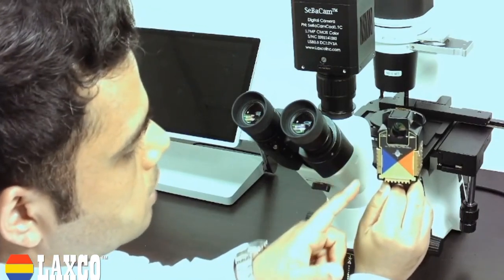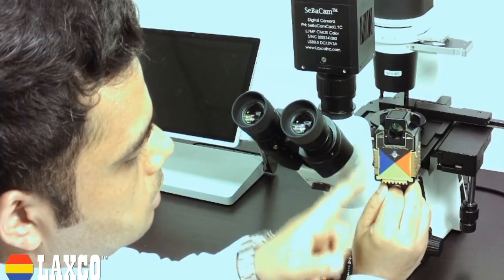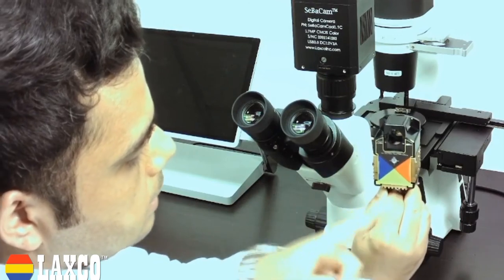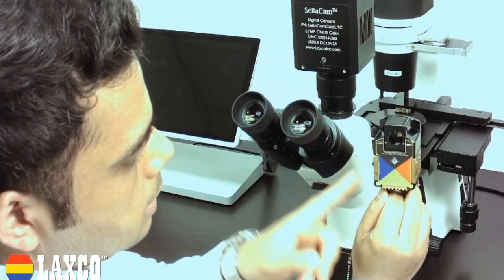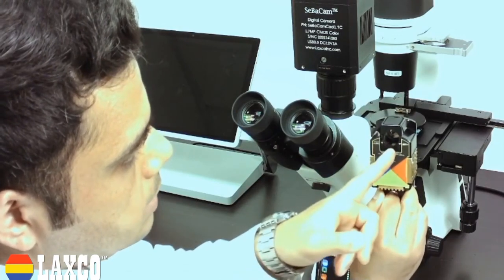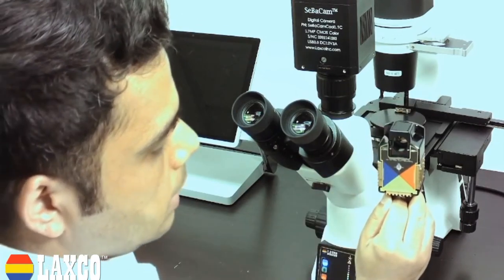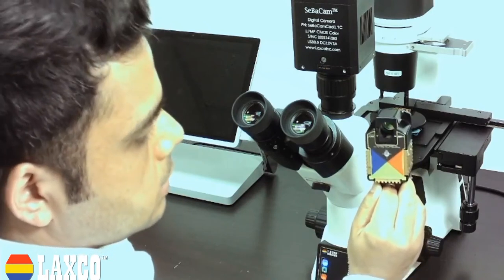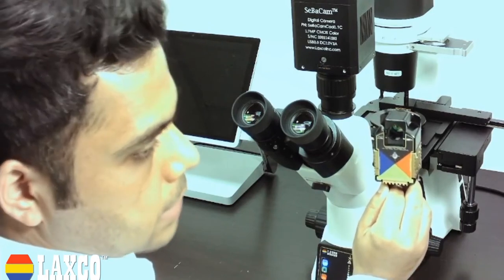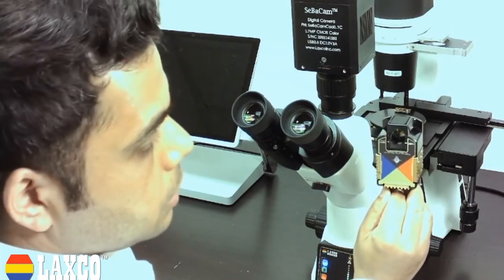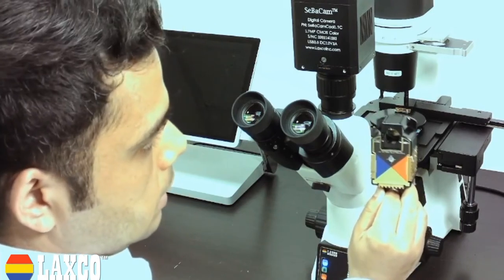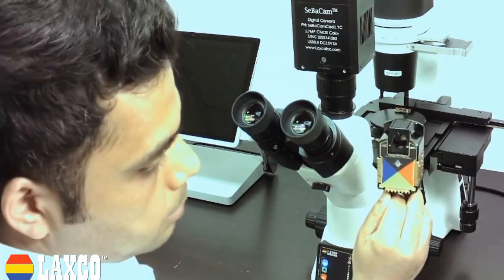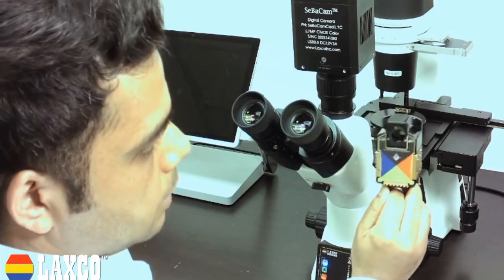So this module goes in. This has all the three LEDs, as you can see here, and this one cube basically is used in the excitation and emission mode. This is our patent pending fluorescent module.